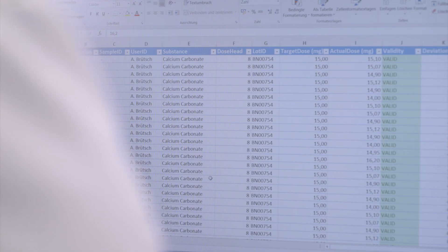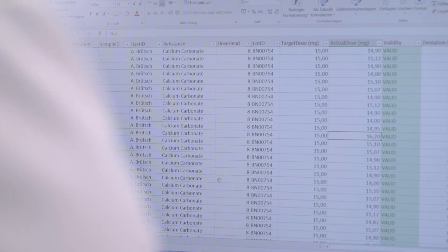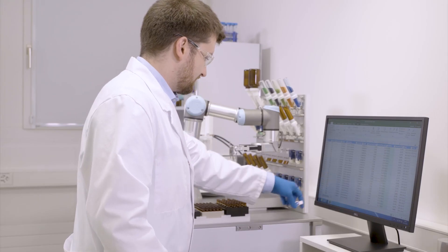Cronos software controls the whole process efficiently and intelligently. Dispensing results can be easily exported for further use.